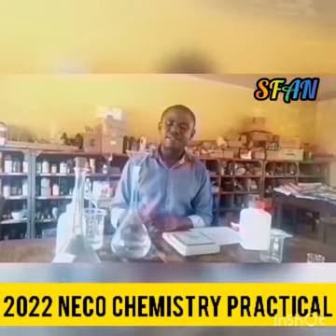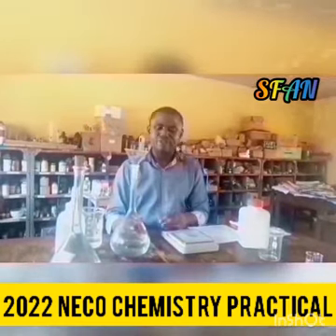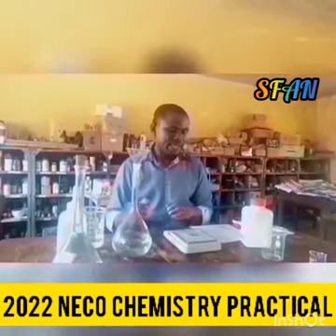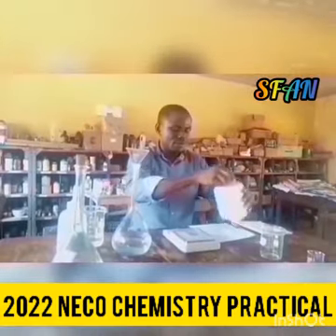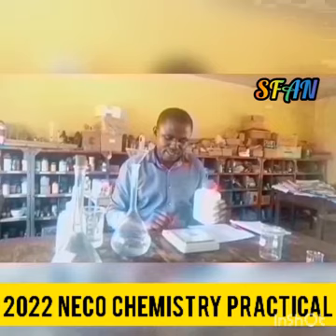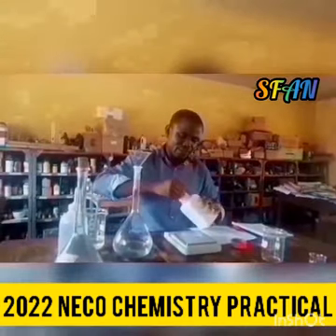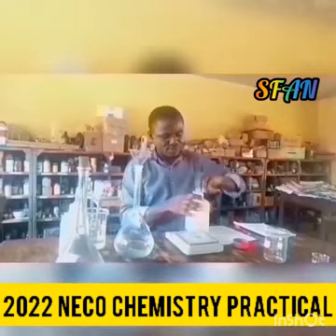So I've transferred some of my distilled water to the volumetric flask. Then I'm going to measure out 4.2 grams of this sodium trioxocarbonate(IV) using my electronic balance.